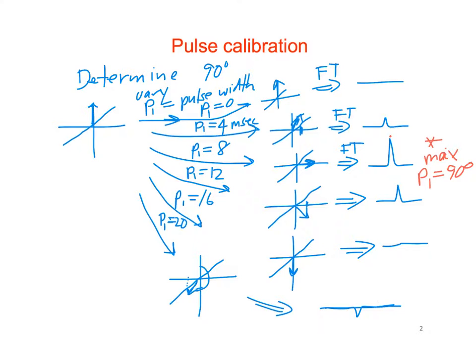Because we're just showing one peak, but if we have multiple peaks present, like multiple various types of protons, could we increase the height of one while decreasing the height of other? I think for the 90-degree pulse, they should all go down. When we talk about relaxation, they'll all relax at different rates. But the peak intensities will all stay relative to each other, regardless of P1, because we're essentially irradiating a wide range of frequencies all at one time, so we're going to tip them all down the same.